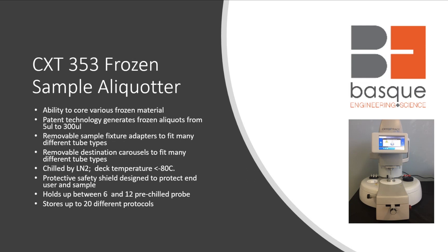We offer two different types of instruments. Our first instrument is our benchtop CXT-353 frozen sample aliquotter. Its main features include the ability to core various frozen material. The patented technology generates frozen aliquots anywhere from 5 microliters up to 300 microliters. The removable sample fixtures and adapters fit any different type of tube. It's chilled by liquid nitrogen and keeps your deck temperature below minus 80°C. It has a protective safety shield designed to protect the user and the sample, holds up to 6 to 12 pre-chilled probes, and saves up to 20 different protocols.